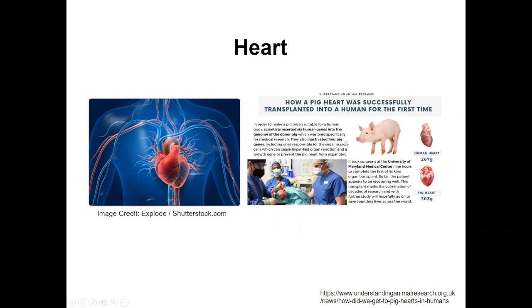The heart is the primary organ to pump blood, the powerhouse of the circulatory system, and it can pump blood throughout the body. In the early days of BioCAT, we focused mainly on rodent studies, and in the last several years, we focus more on pig heart.